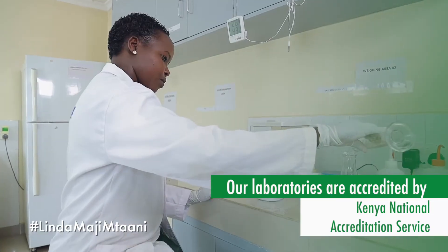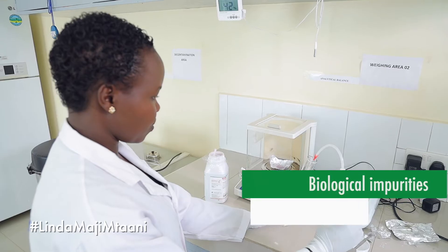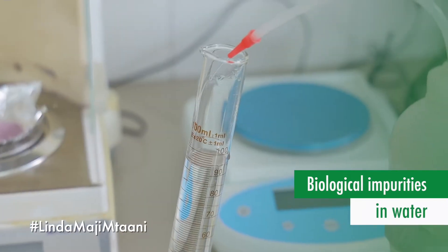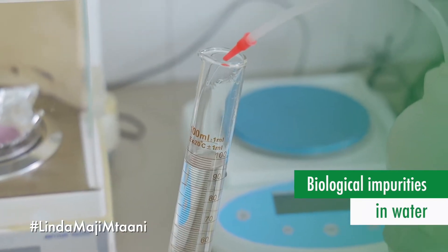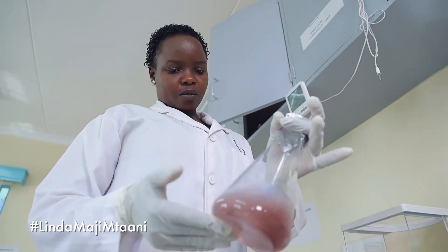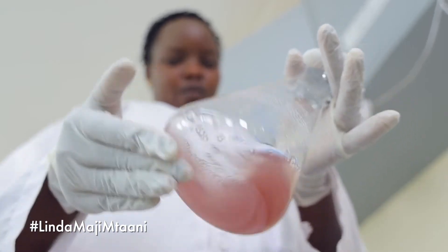In this laboratory we check for the various biological impurities in water — that is the living organisms that are present in water and are likely to be harmful.